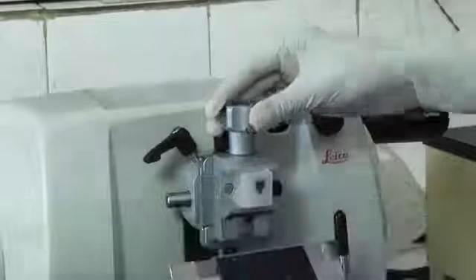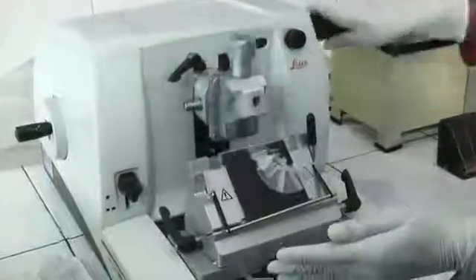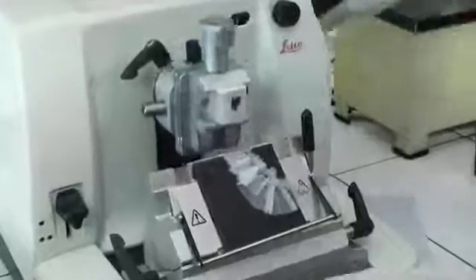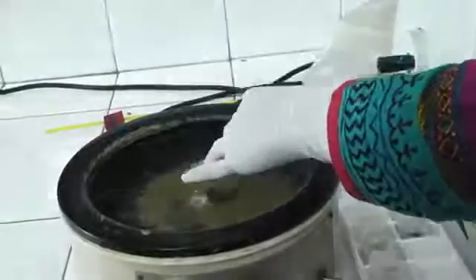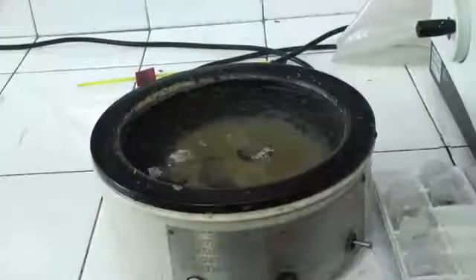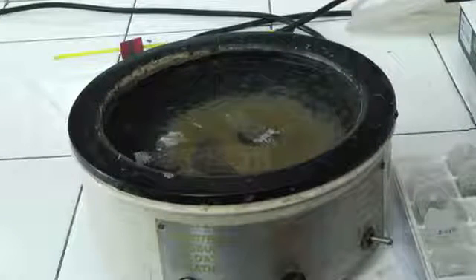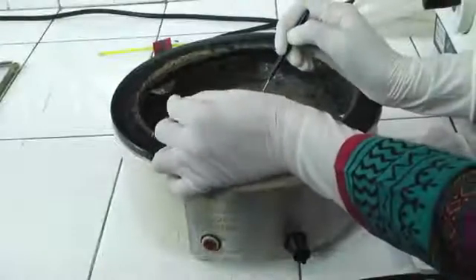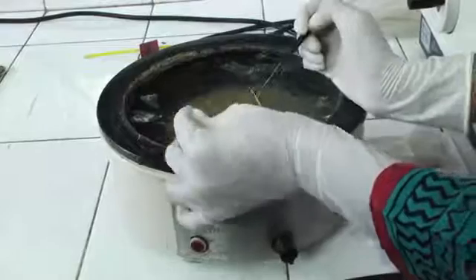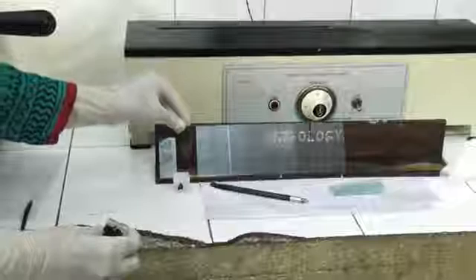After sharpening the microtome knife in the knife sharpener, each block of tissue is fitted in the microtome machine. Sections are cut at 4 to 5 micron thickness. Ribbons of good sections are selected, floated and flattened on lukewarm water in a water bath. The temperature of the water bath should be maintained at 50 to 55 degrees centigrade, which is around the melting point of the wax. The flattened tissue sections are placed on clean albuminized labeled slides and dried on the slide warmer.